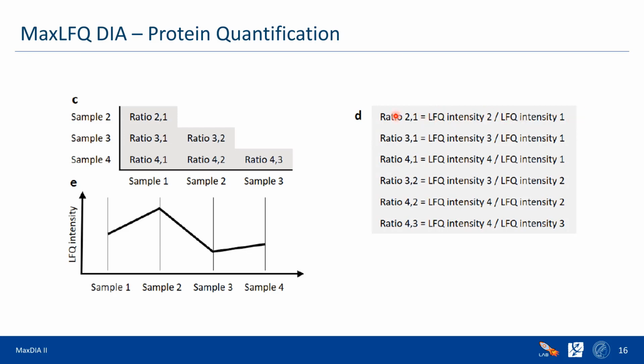And we have, as a result, a system of equations, but remember this fact: sometimes we may not have enough intersection. We may not have enough peptides intersecting between samples for the same protein. As a result, it is going to be a non-value, and we cannot do much about that. But we try to resolve this system of equations, and we come up with LFQ intensities for each protein, and we can see how these LFQ intensities go from sample to sample.